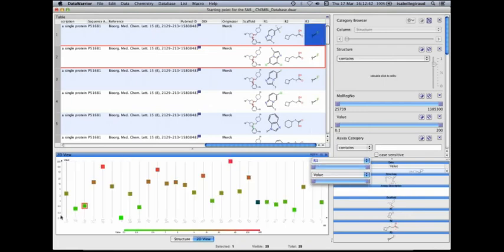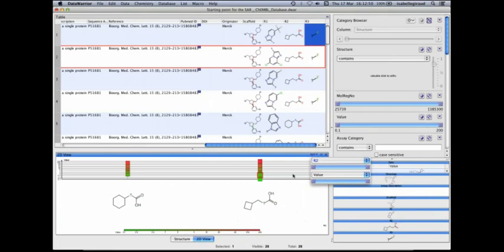Then I can go further. R1 contains all these different substituents, lot of different substituents. Every time there is only one. R2, there are only 2 variants of R2 substituents. Sorry. And R3 only consists into fluorine or nothing. So I will just increase the size of the window.